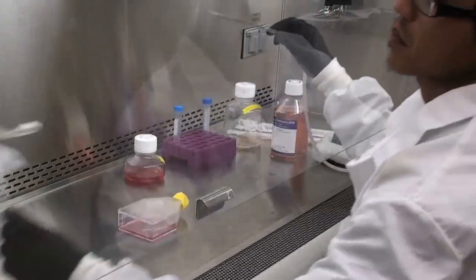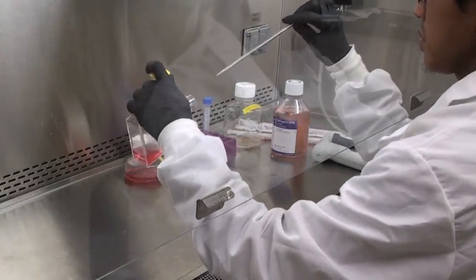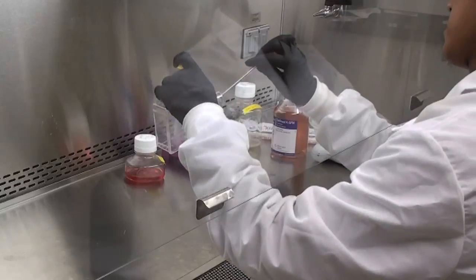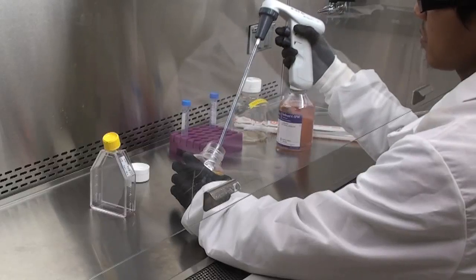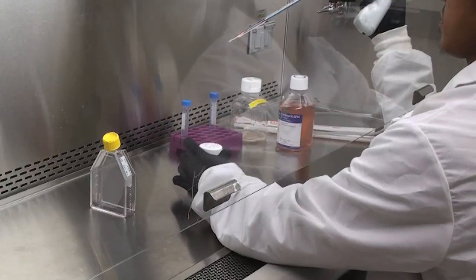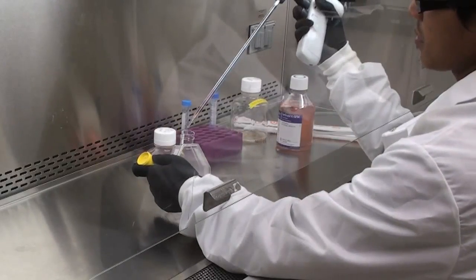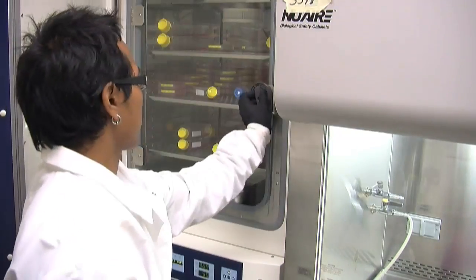Next, aspirate the media from the flask. After aspirating the old media, add a small amount of trypsin. Place the flask back into the incubator. This causes the cells to lose adherence to the culture flask.